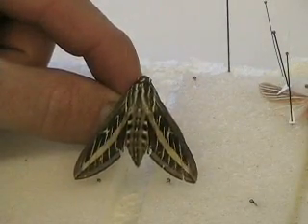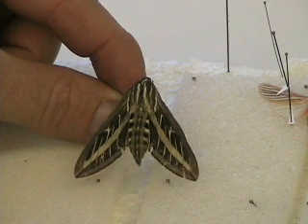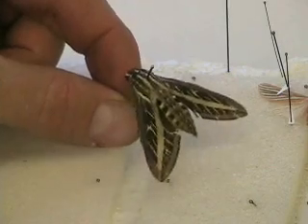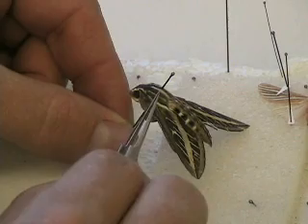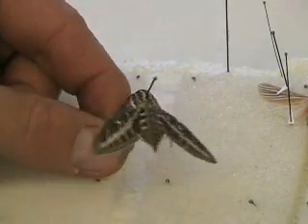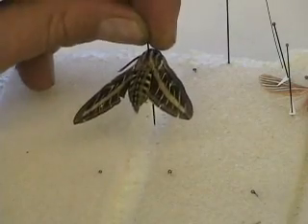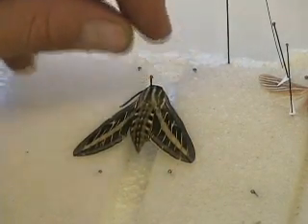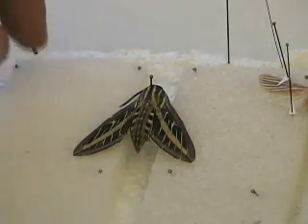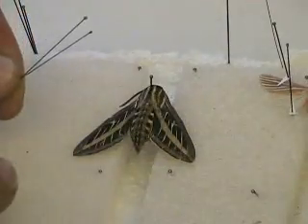This is a white-lined sphinx, Hyles lineata — one of the most common moths and a pretty easy moth to pin. I recommend it for beginners starting a moth collection. The body parts are easy to distinguish: head, antenna, thorax, abdomen, and wings. You can even see the tongue here. I've already put the pin through the center of the thorax just like a bee, then placed the specimen in the foam so the body is in the gap between the two pieces of foam. I'm going to spread the wings using double-aught or one-aught pins, which are good sizes for a moth this big.